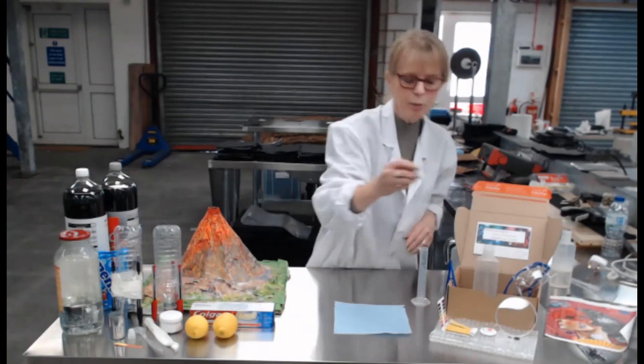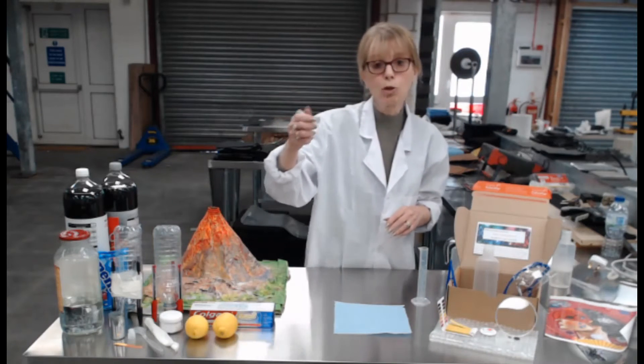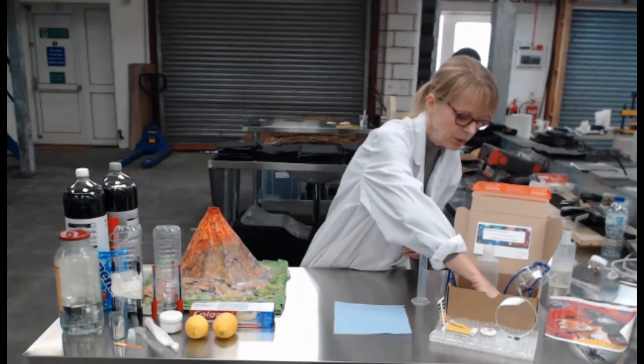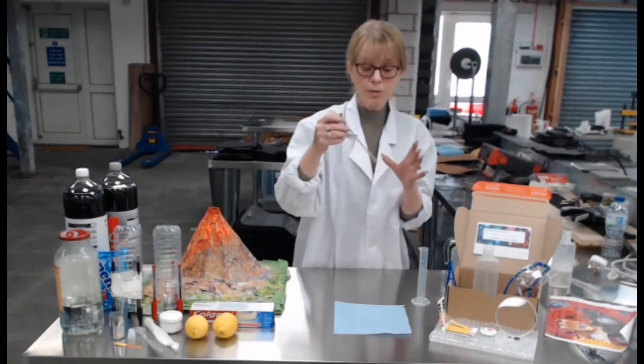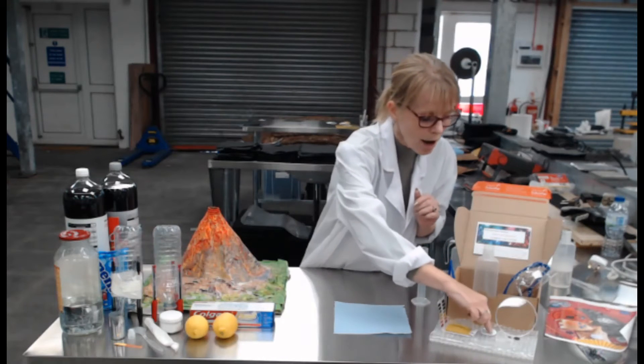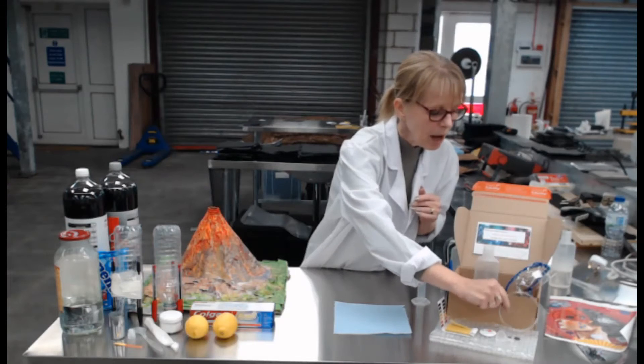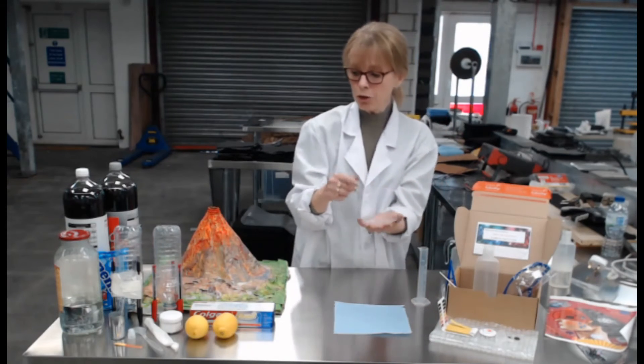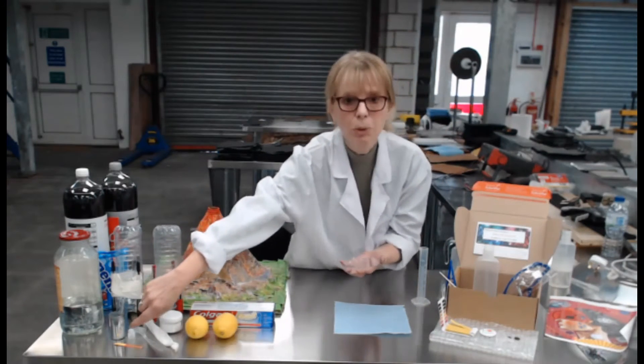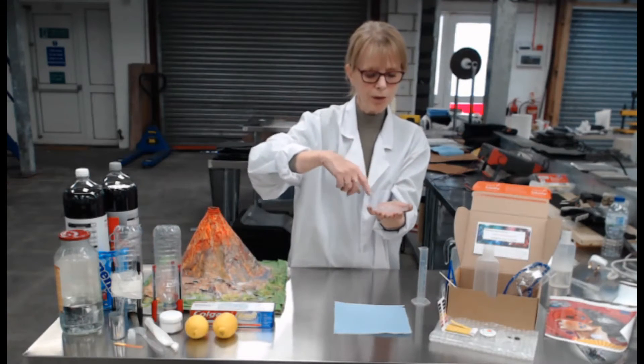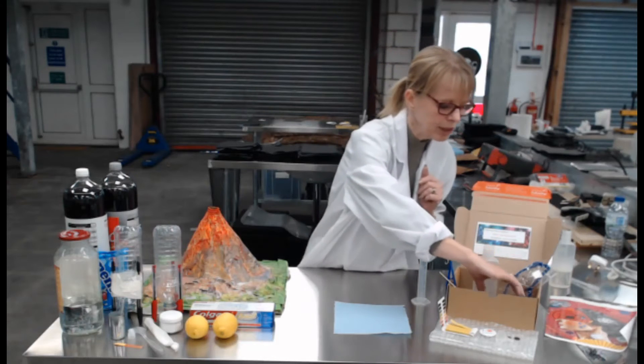There's also a pipette if you want to just take out small amounts to test, and a stir so that you can stir the different things together and make sure you get a good mix. A fun badge, there's a range of different ones, I can't promise what it would be. A petri dish which is again good for if, for example, you wanted to put that universal indicator paper into a petri dish.